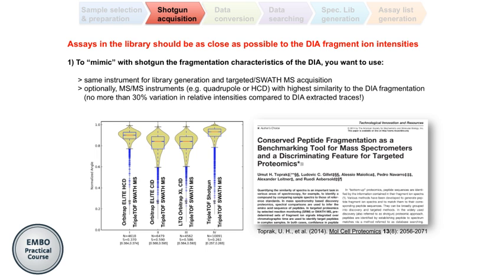So they would actually be the best type of scenario in order to get the closest assay from the beginning, on the same instrument, from the exact same file actually. So you get as close as possible.